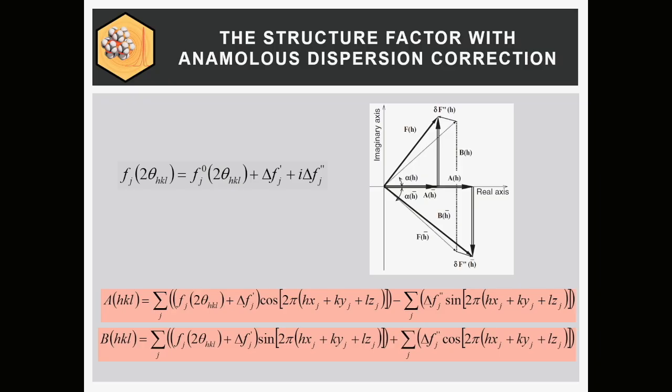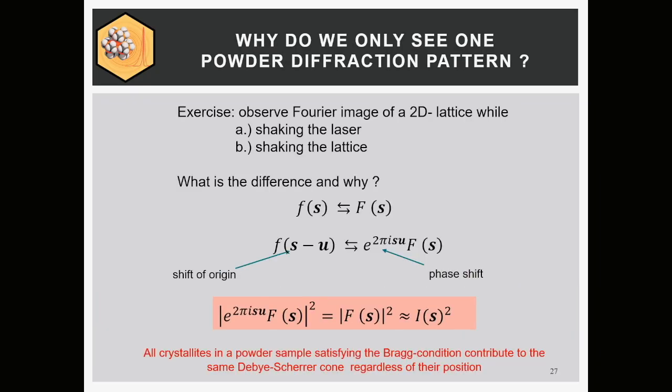I want to show you that this simple formula already is complex. You have seen how complex it was already for the position of the peaks. Now also for the intensity of the peaks, without any corrections. This is the formula, for example, which is in Topaz, taking the anomalous scattering part into account, which is relatively complex. And maybe one thing, I think this is important to remember.